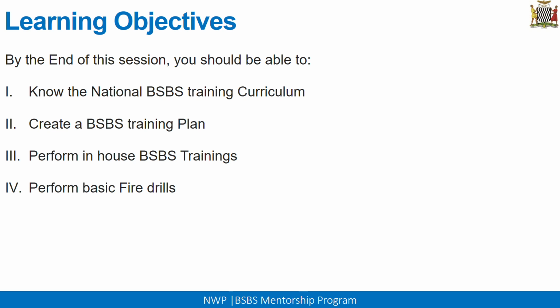and how you can plan for your trainings. Then you should be able to perform in-house biosafety and biosecurity trainings at your own facilities as well as your institution, or, if you want to create a training program for your district or province, you can do that. Lastly, you should be able to perform a basic fire drill. During the session, I'll point out the key things that you'll need to perform a basic fire drill for your laboratory.